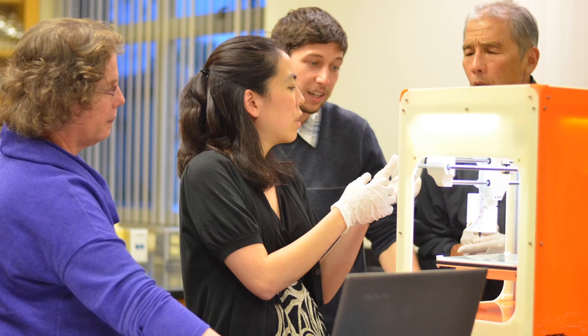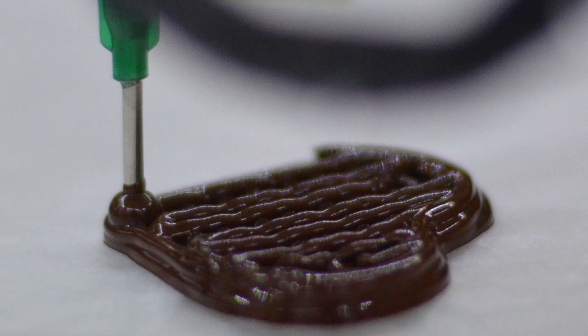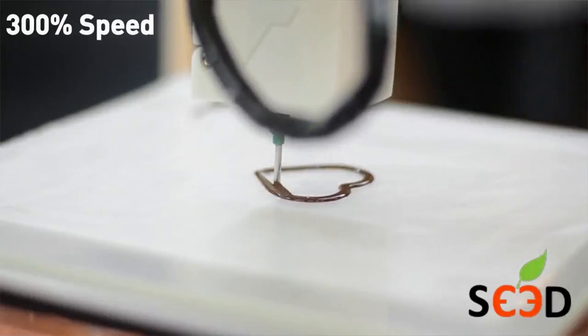I've been able to attend all four of the educator workshops that have been offered by SE3D so far, and I really enjoyed being able to see the different curriculum tracks that are offered. I see the bioprinter being used in the classroom to run a number of quick and hopefully easy experiments to teach students about biological concepts, be a little replicable, and also start to answer their own questions.